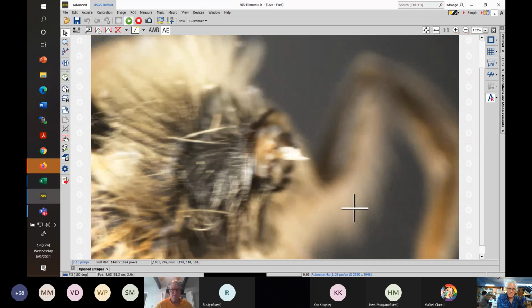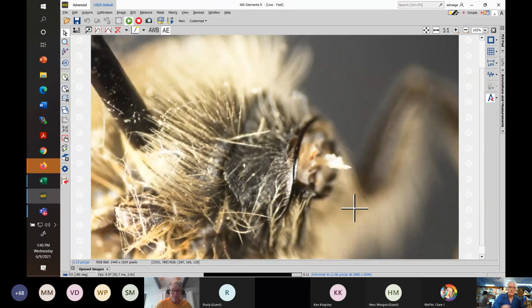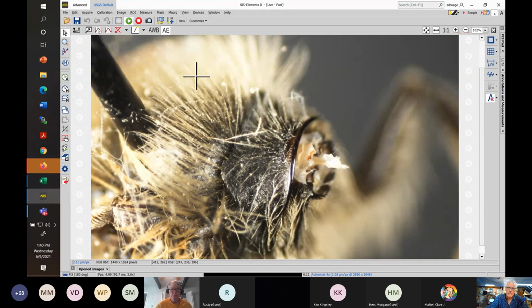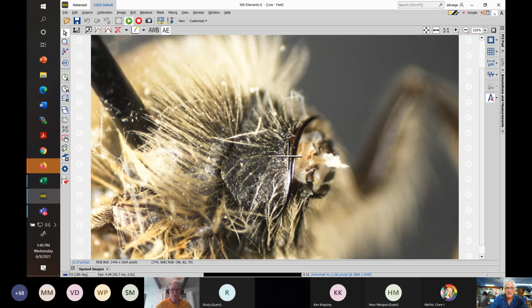All right, so now we're going back to pronotal collar. So let's get oriented. So what we're looking at is the edge of the scutum here. So the pin usually goes through the scutum. You have the bases of the wings with tegula on them, which are the wing base protectors in lots of ways. The head was here, and then this feature going down here and usually around, it's difficult to see, around like that, and then back up and then over here.